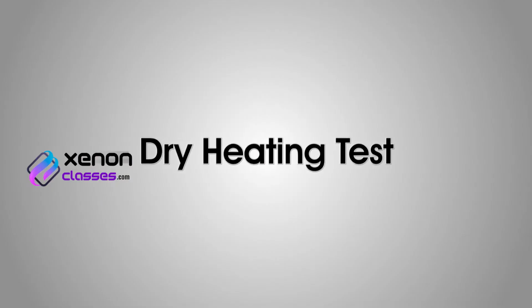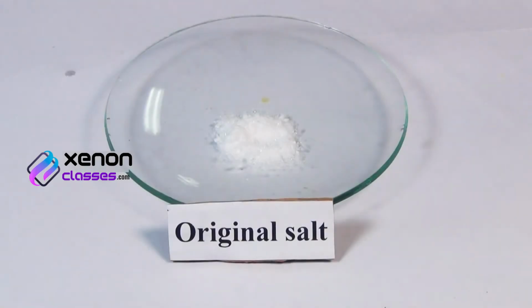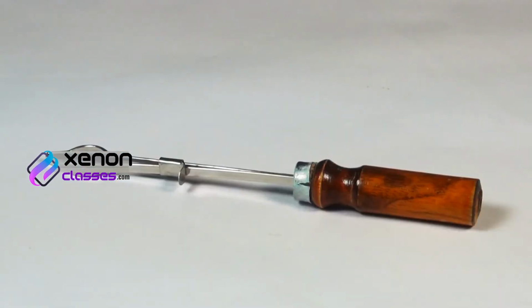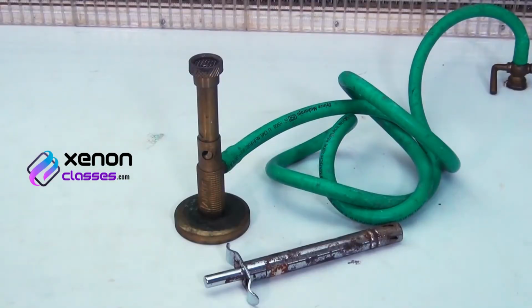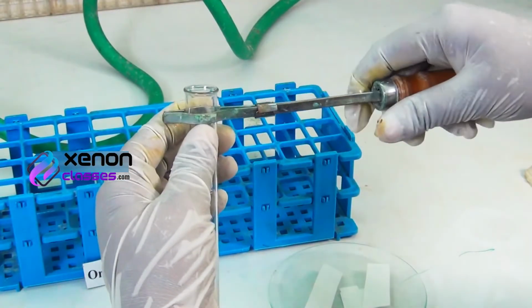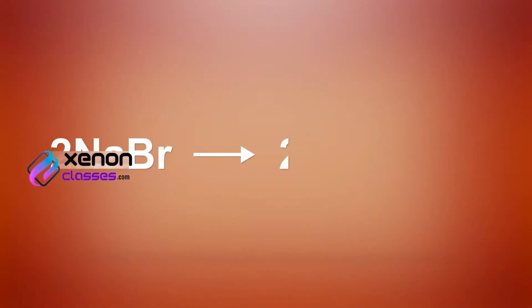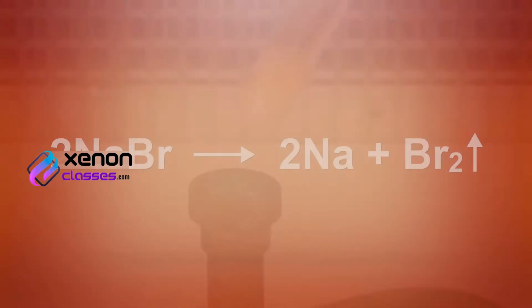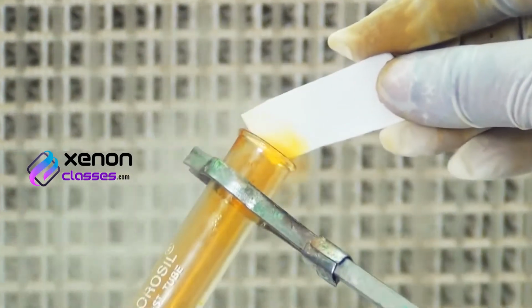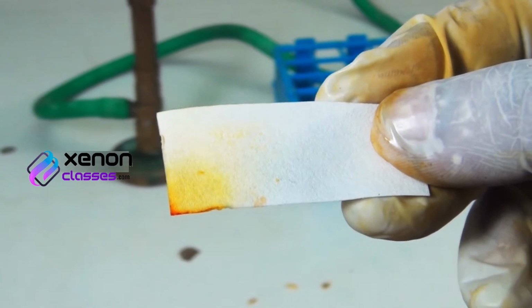Dry heating test. Materials required: original salt, starch paper, test tube holder, and Bunsen burner. Procedure: take a small quantity of the salt in a test tube and heat it over the Bunsen burner. Bromide undergoes thermal decomposition to form reddish-brown vapors of bromine. Place a starch paper over the mouth of the test tube. The liberated bromine imparts an orange-yellow color to the starch paper.